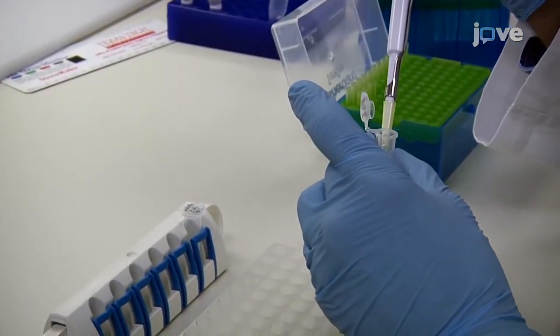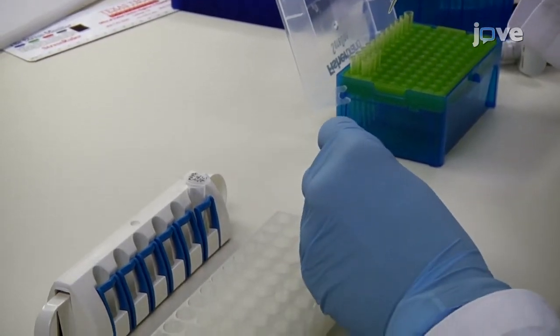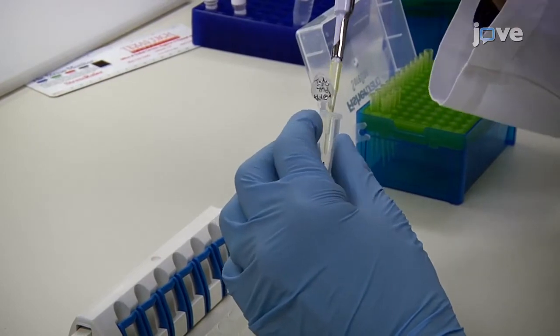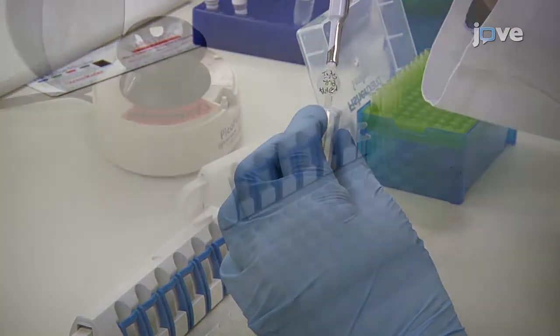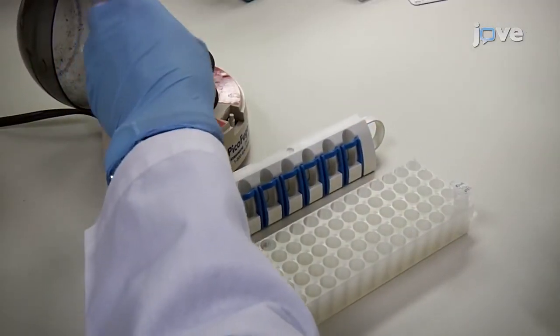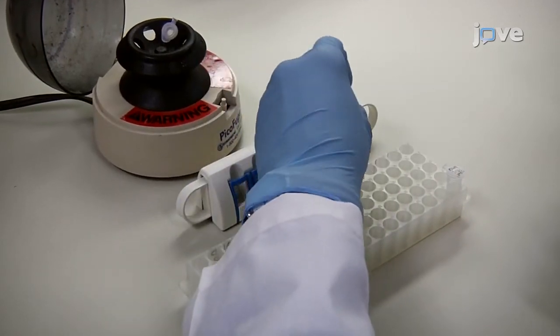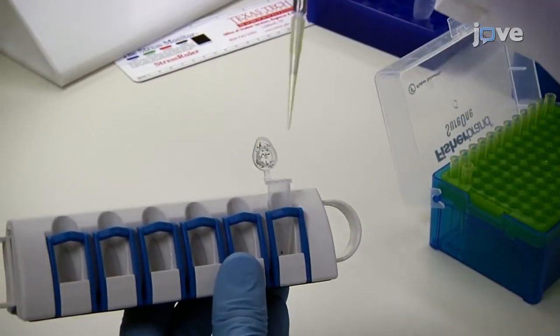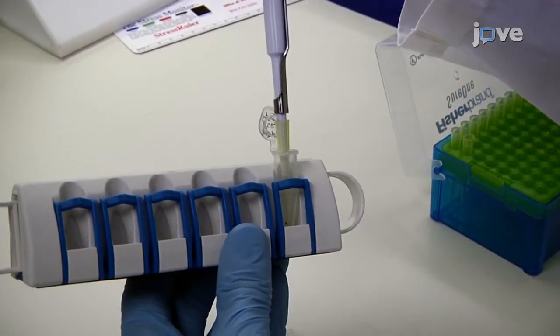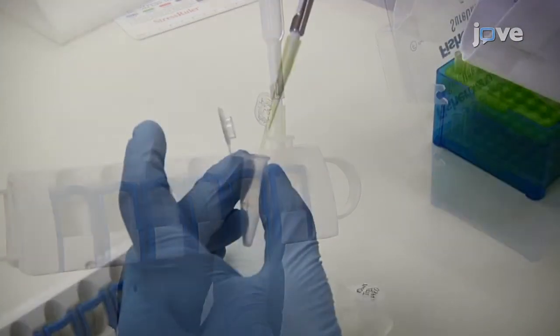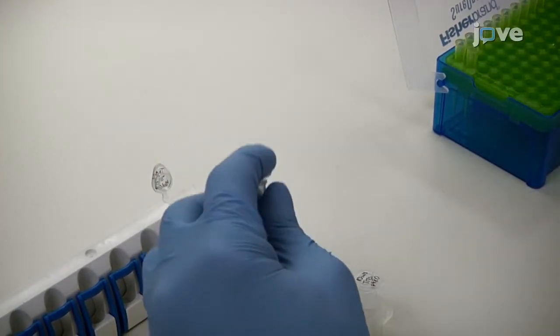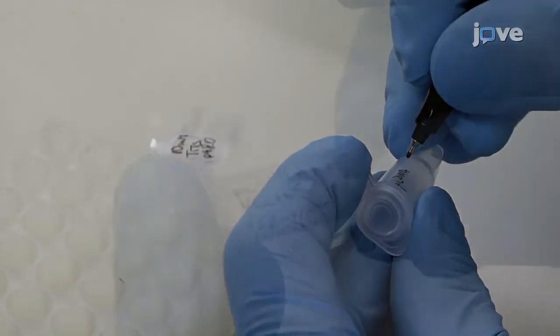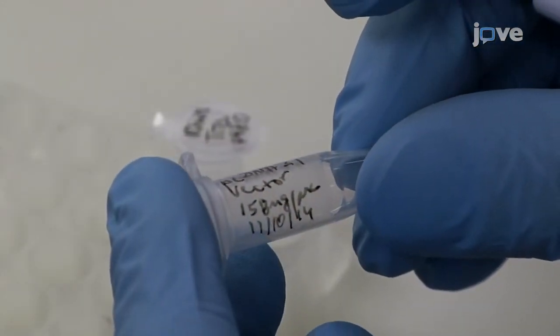Then, re-suspend the dried beads in 10 microliters of 10 millimolar tris hydrochloride pH 8.0. After 2 minutes, spin briefly, and then position the tubes on the magnetic collector for 2 minutes. Remove 8.5 to 10 microliters of the clear solution and place it in a new pre-labeled tube. Determine the concentration of the DNA fragments by UV spectroscopy.